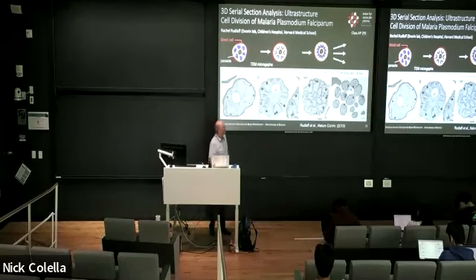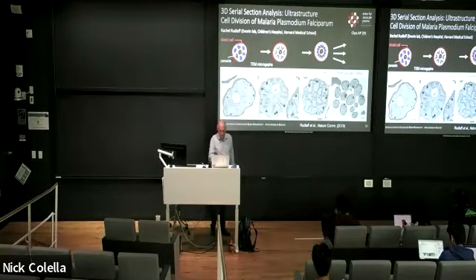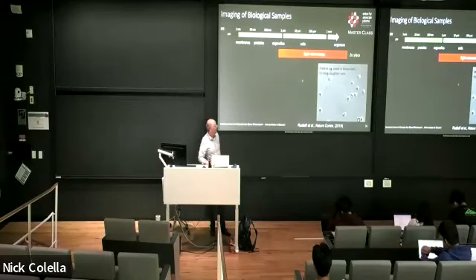And in the last stage, you have then 30 daughter cells, which then break out of the blood cell and further infect the bloodstream of the patient. And so the research group was very much interested in the details of this evolution, and we were able to image that with 3D imaging.